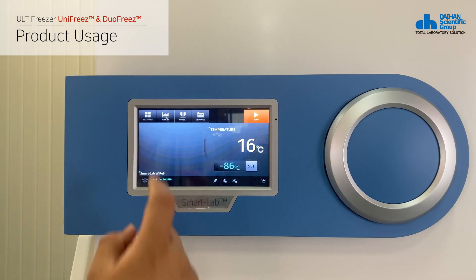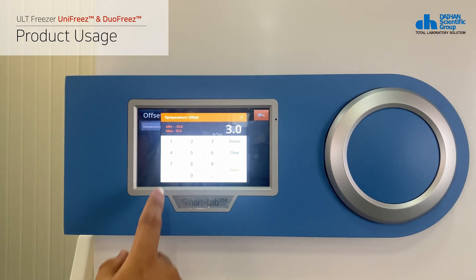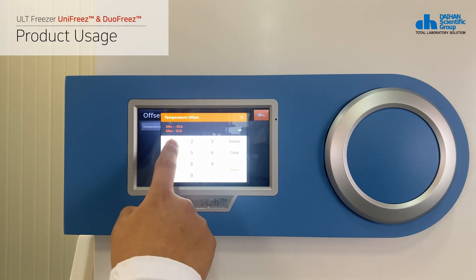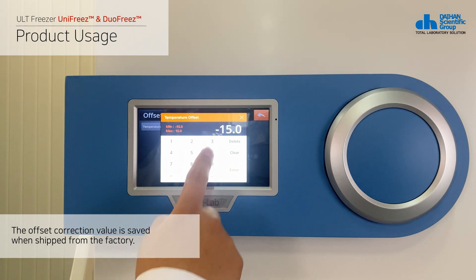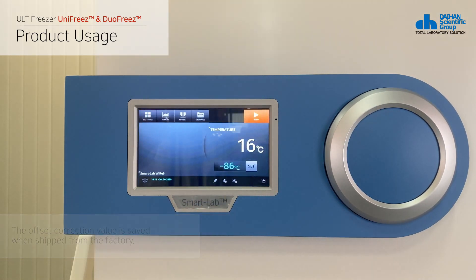The next is how to correct the temperature value. If a temperature correction is required, click the offset button on the top of the product to enter the temperature correction menu. Temperature correction is possible from plus 15 degrees Celsius to minus 15 degrees Celsius. If the settings are complete, you can save them by clicking the back button at the top of the screen.